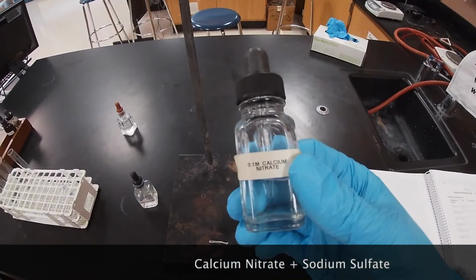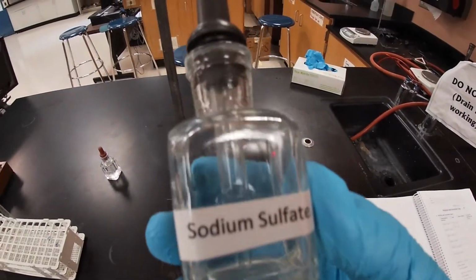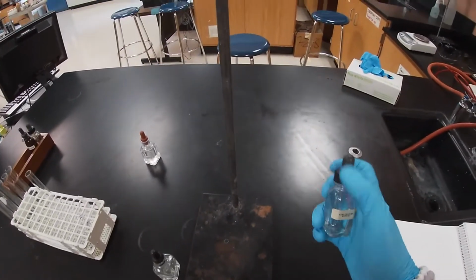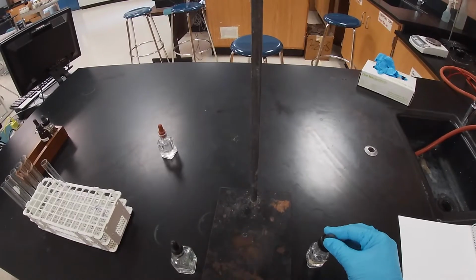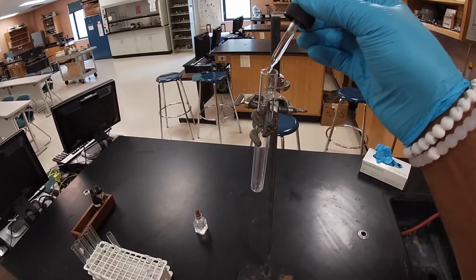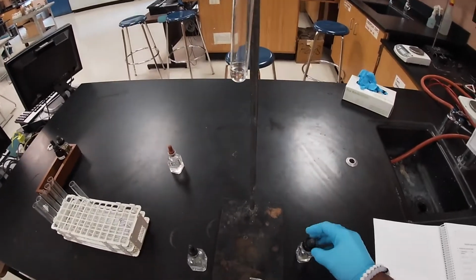So here we have a solution of calcium nitrate, 0.1 molar solution. We're going to run the second reaction, of the calcium nitrate group. I'm going to react it with sodium sulfate, and we're going to see whether a precipitate forms. Here we have two solutions that are soluble in water. I'm going to get about 2 dropperfuls, and here we have our setup, our test tube. I'm going to get a few droplets in there.